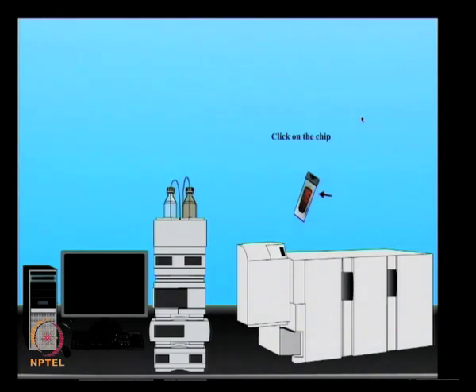There are certain commercial advancements available to improve these limitations. Agilent's HPLC-Chip technology is a microfluidic device which carries out nanoflow high performance liquid chromatography and reduces the limitations of several fittings and connections.